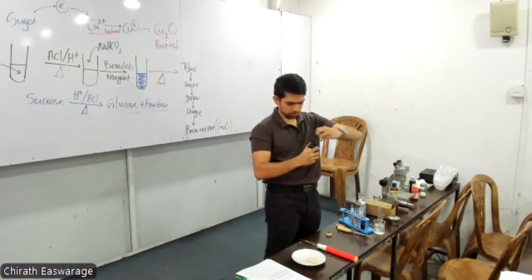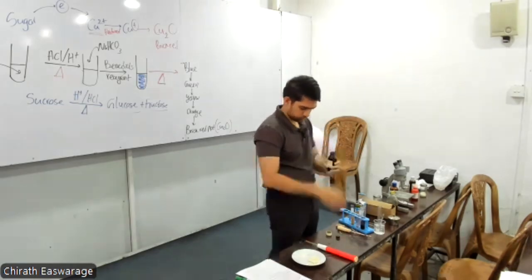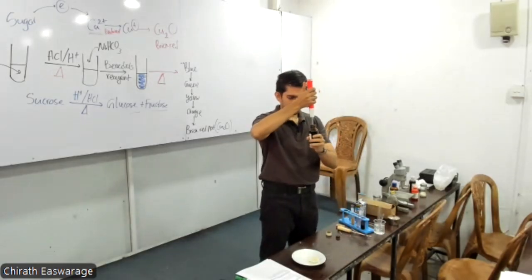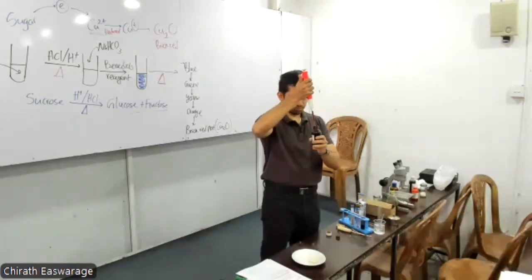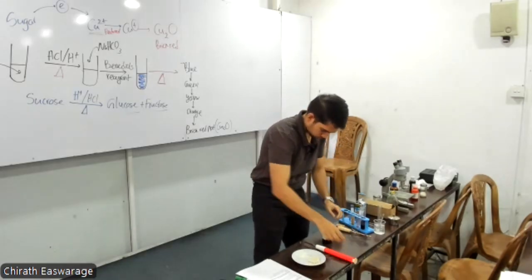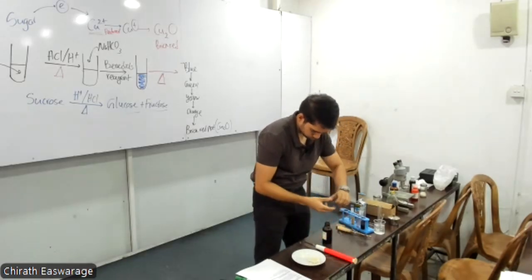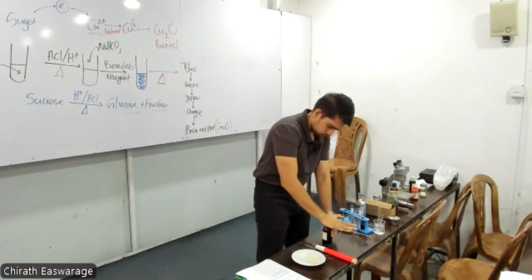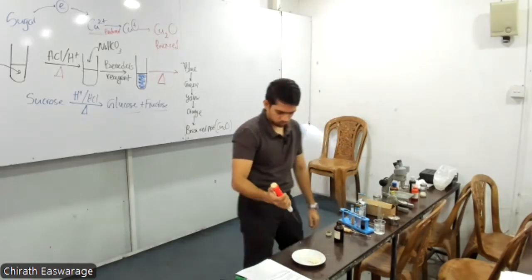Online students, you saw the color change, right? I'll show it again. Right.